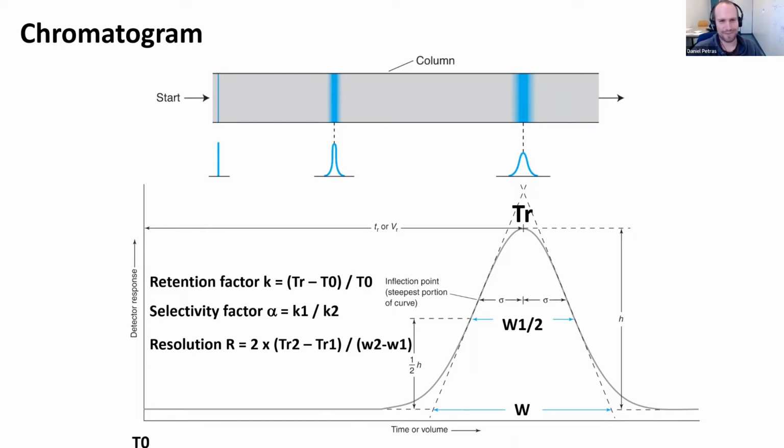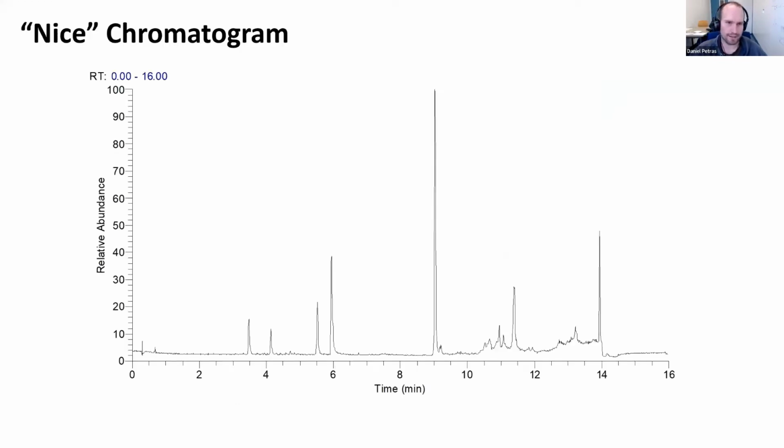And oftentimes we unfortunately see not so nice chromatograms, but just to give you an example, this here is a 5 component QC mix we typically run from different sulfonamide antibiotics, and you can see very nicely that those peaks are very sharp, right? So those are very narrow, almost looks like GC peaks. So this is very high resolution for a UHPLC separation.